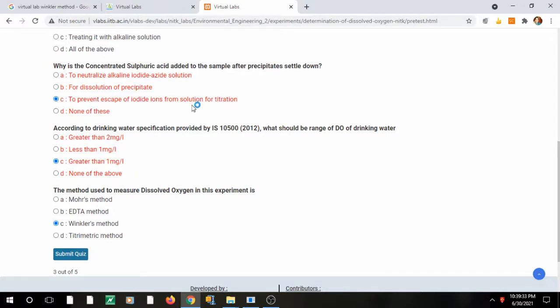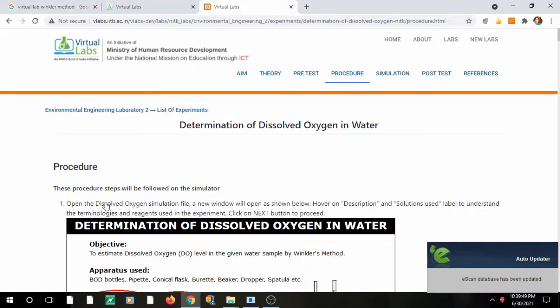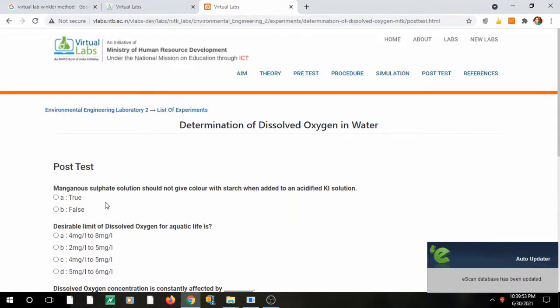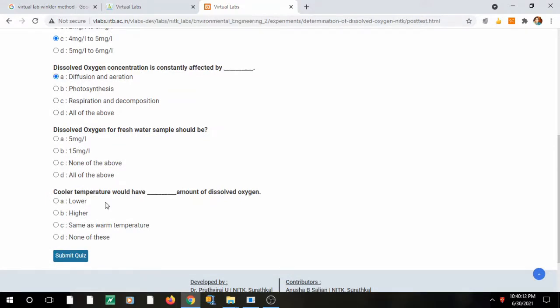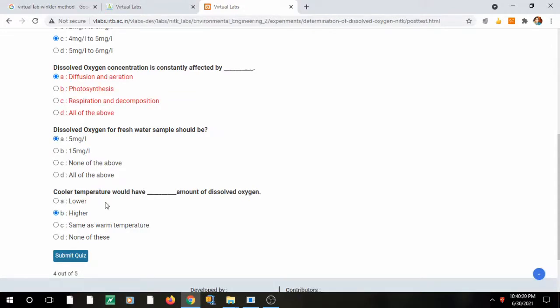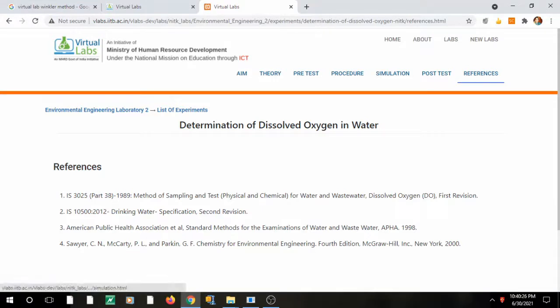After answering, it will tell you which ones are wrong. For example, the question about preventing escape of iodide ions — it will score you accordingly. There is also a post-test once the simulation is done. Similarly, you answer questions like what the dissolved oxygen should be, and it will show your score. You can try and explore these. The last section is references.